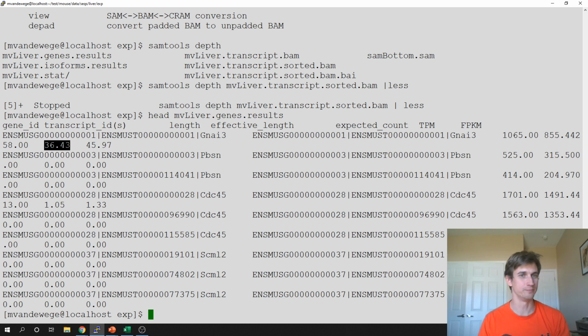So it's kind of low. Actually, it's not low. We have 20,000 genes, several thousand transcripts, so it's going to happen. We're going to see a lot of genes with TPMs that make up a very small percentage of the total transcriptome. But that's what this TPM number is effectively trying to be: a percentage of the total.